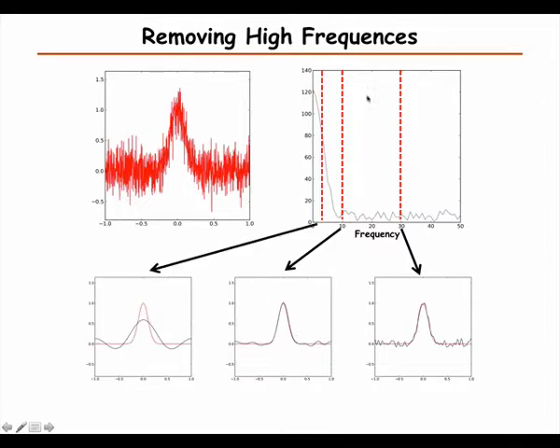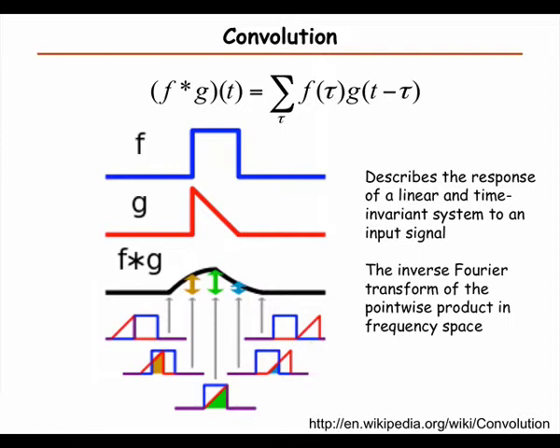But then if we cut even further down, now we get a widening of the peak and ringing further away. So that's the trick: to choose where to set this limit, to cut away the noise but cut away as little of the signal as possible. This middle case is probably a very good compromise. So now, there are other ways to do this also.